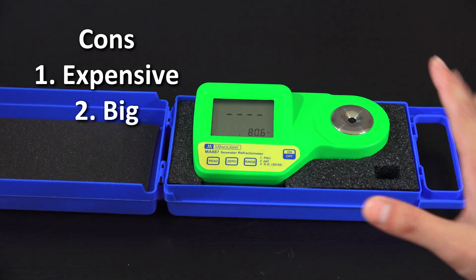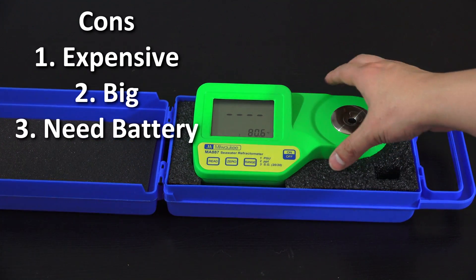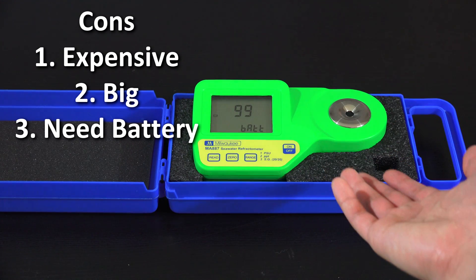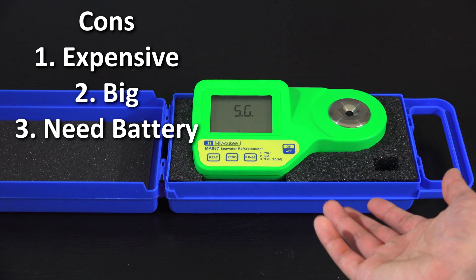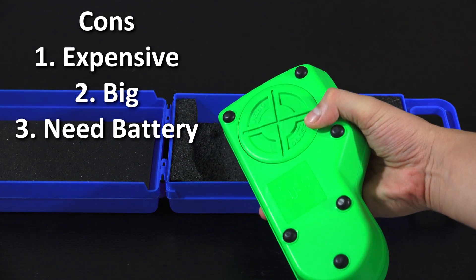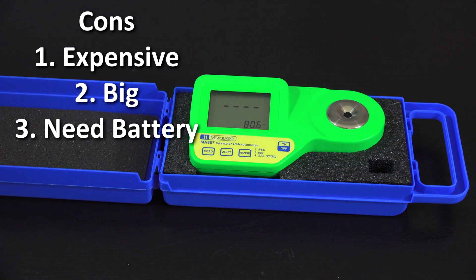Finally, the last con is that it runs on battery, so at some point you'll need to replace it. It's a simple replacement — just open it up and swap it out — but it does mean that unlike the analog unit, which requires no battery at all, this one has that dependency.